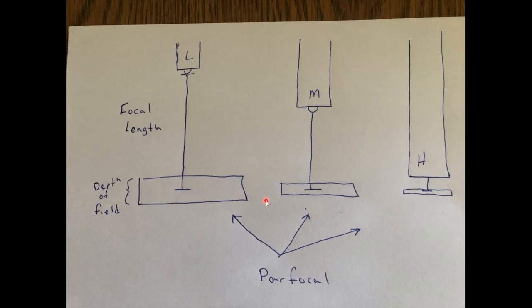But when you switch over to the medium lens, it's a little thinner. Since the microscopes are parfocal, the focal length away from the medium power lens should be right at about the same place. About. It's not exact. So you're going to need to use that fine focus knob to wiggle it around a little bit to get it in good focus.